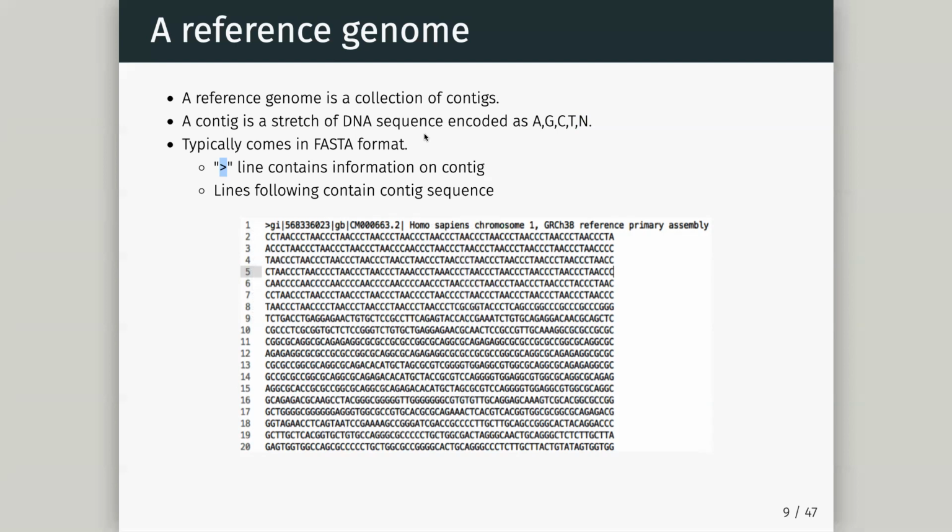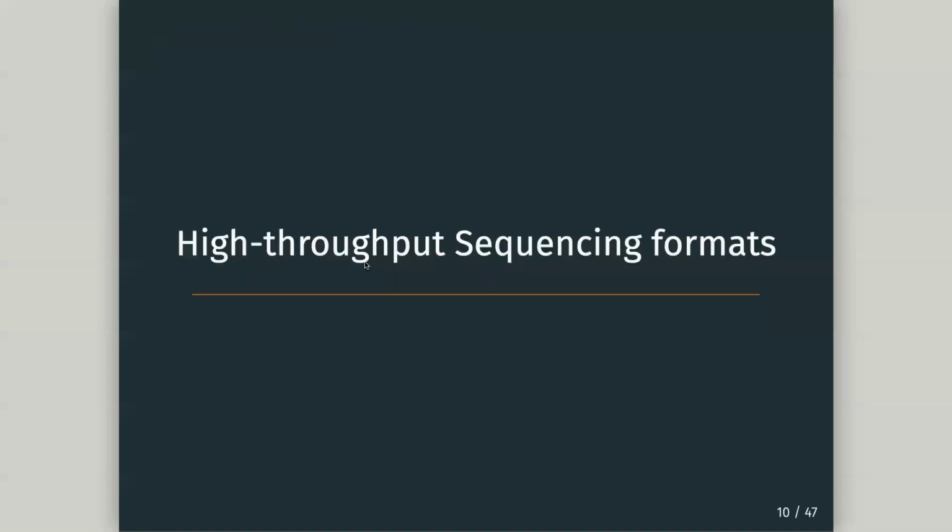contents. So that's what our Fasta looks like, and that's what we're going to need to provide to our aligners in order to align the data. And if we want to view something in IGB, a custom genome, we're going to need to provide this too.